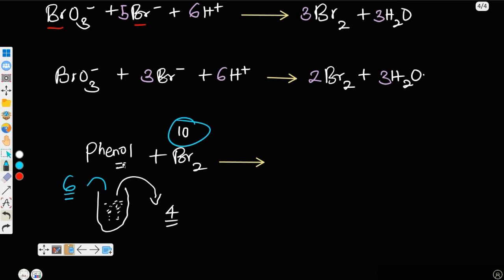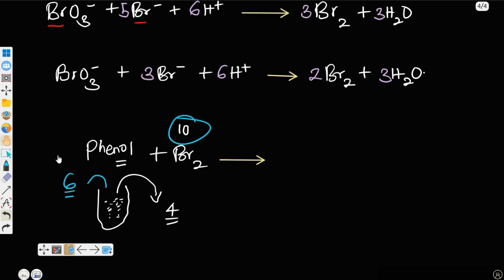Back titration. We did this when we were in year 2, where we ran a blank. Are you getting it now? So that is what we actually do in this particular experiment. What we are going to do is, first of all, react phenol with bromine, take the unreacted bromine, and get the amount of unreacted bromine. Then from that, you will be able to get the amount of bromine that reacted. Now, how do we carry out this experiment?